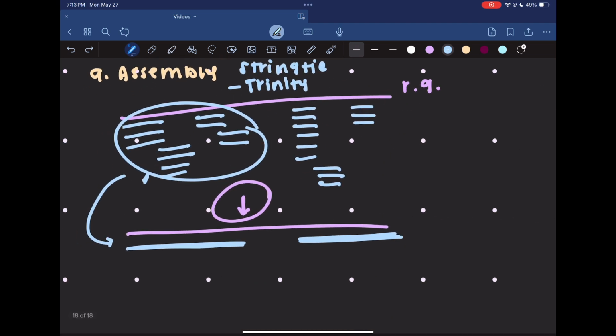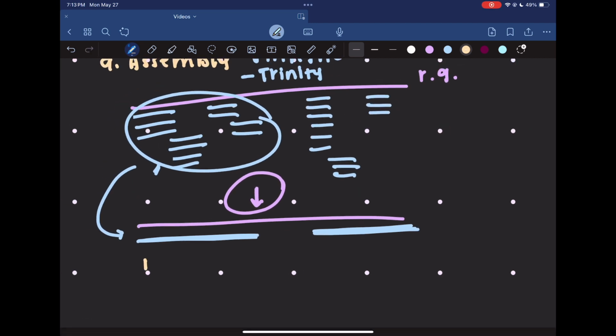It's going to take your BAM files that you generated in HiSat2 as input. You'll input them one at a time, to my understanding. I had BAM files from different tissue samples, some from the head, some from muscles, and I fed each individual one into StringTie.